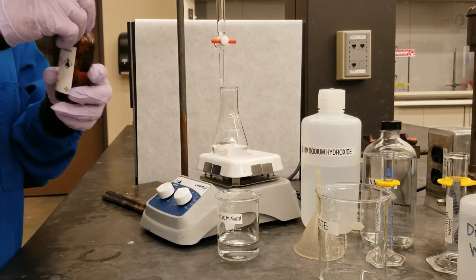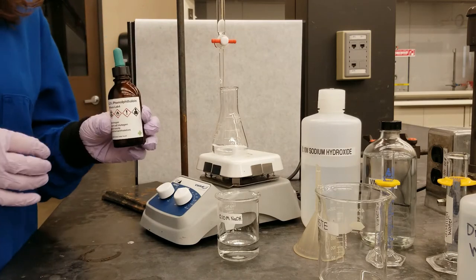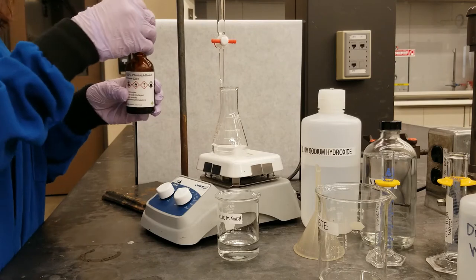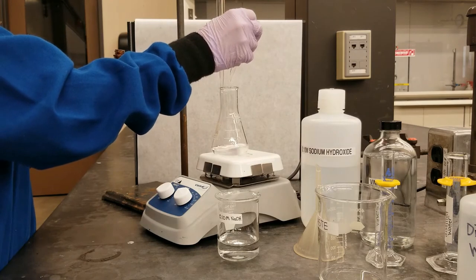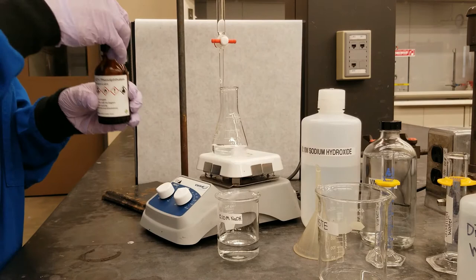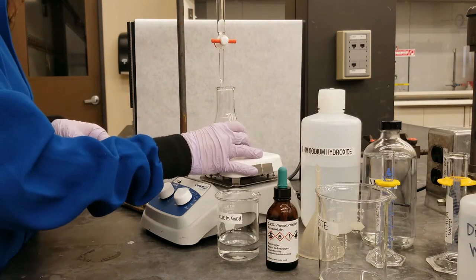As that's stirring, I will add 5 drops of our phenolphthalein, which is our indicator solution. This indicator solution will give us a visual clue as to when our equivalence point has been reached. Now we can begin our titration.